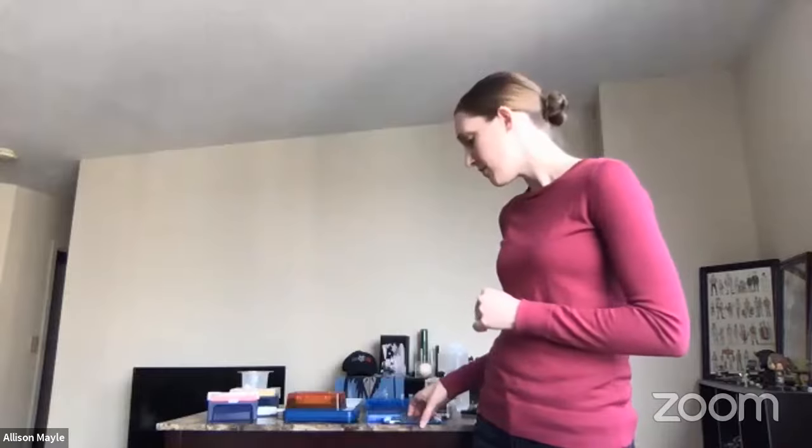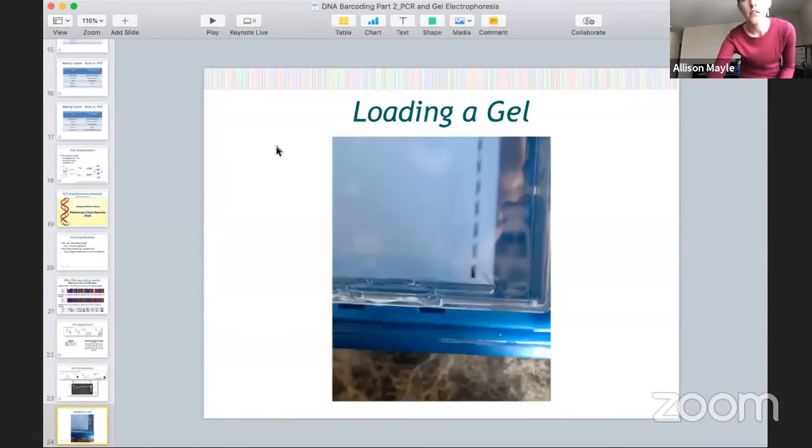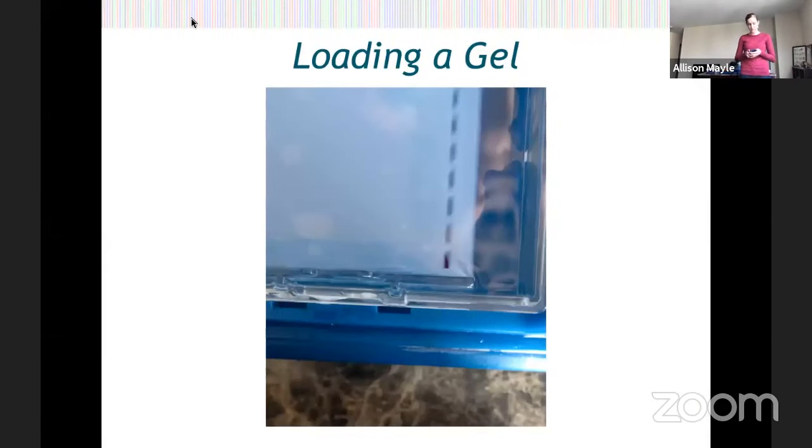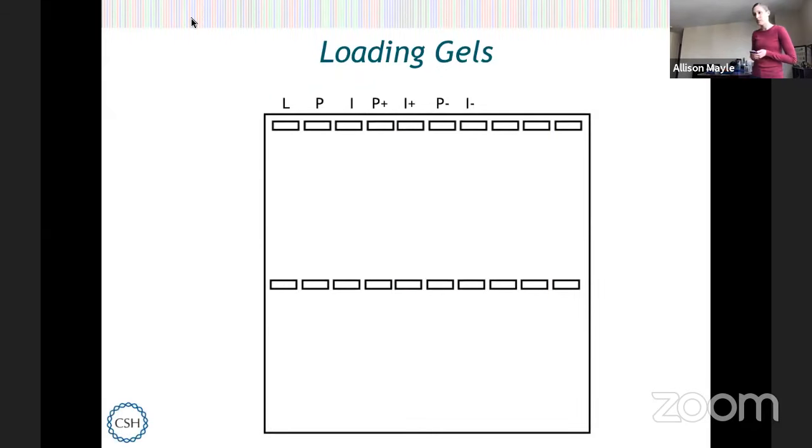We're going to separate our DNA by size, and this is going to help us determine whether, when we made copies of DNA by PCR, those copies are the right size — whether we think we actually copied a barcode. Something very important when loading gels is you should always have a map for yourself of where you put your samples. In science, we want to keep a good lab notebook and track of what we're doing. I can't tell you how many times I've thought I'm going to remember this, and then 10 minutes later totally forgot.